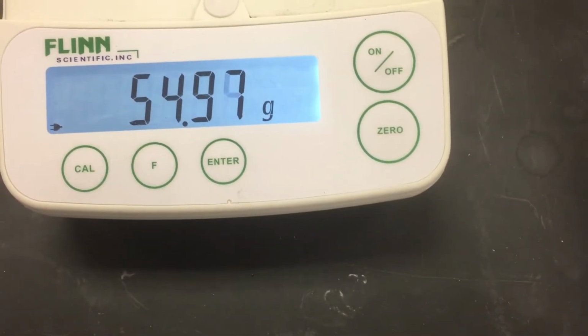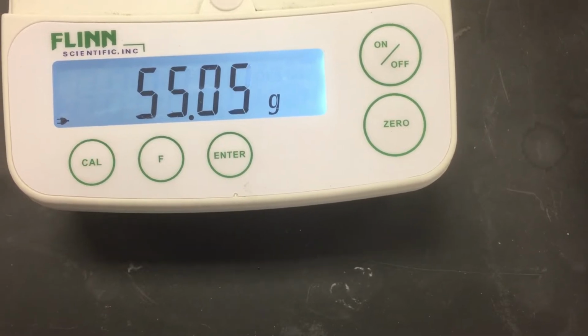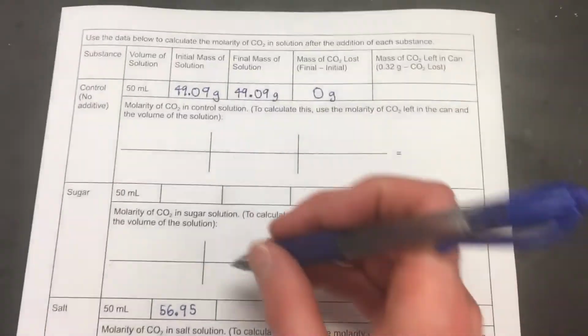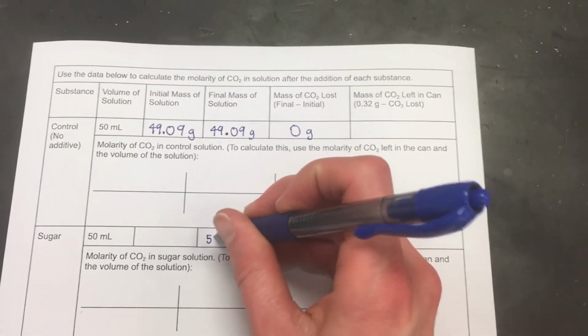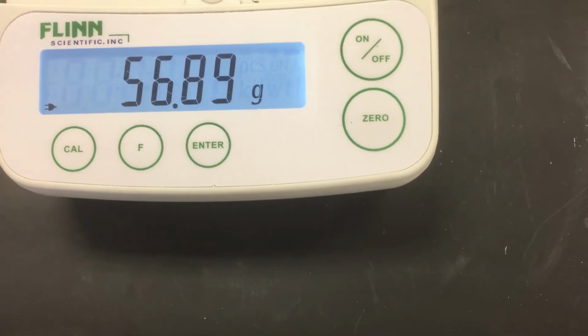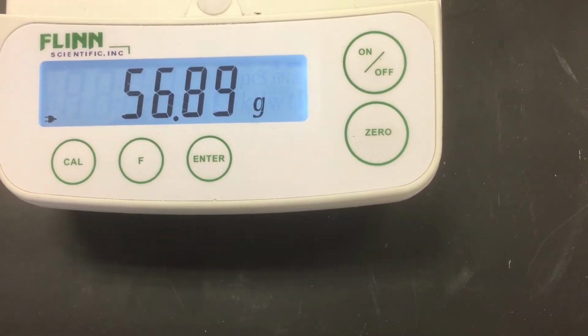Let's look at the sugar. Now I forgot to write down what the sugar was before, but now it's kind of fluctuating. We'll say it's at 55.05. Okay, the salt, it looks like, is at, again, we're fluctuating a little bit, 56.89.